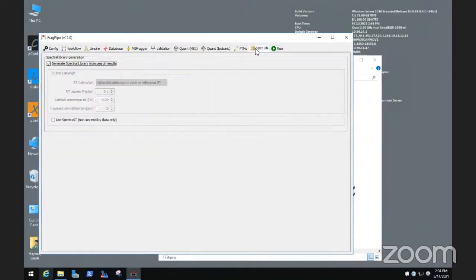you will see that here there will be automatic selection of a reference run, because we assume that in this case you have single-shot DIA data. So instead of aligning to some iRT reference or common peptides, the preset option is that one of the runs will be selected as reference, and all other runs will be aligned to that run in retention time.